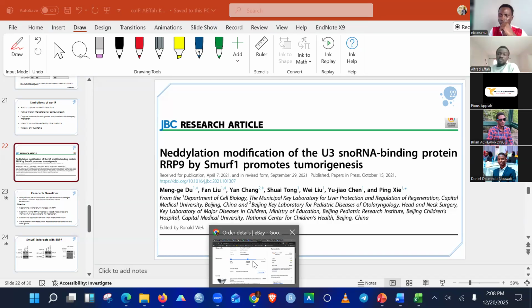Let's say two of them, you did live imaging and then you could see that they co-localize in a particular location within the tissue. You always see them in different tissues. You could see that these two molecules are there, but you don't know what these proteins are. What you do is characterize your protein. You can also sequence to know what the protein is made up of. Now, if we know the sequence, we can develop antibodies against them. So that's the basic thing I think you should do. Once we're able to develop antibodies against them, we can confirm whether they were interacting or not. So that's one way you can do it.